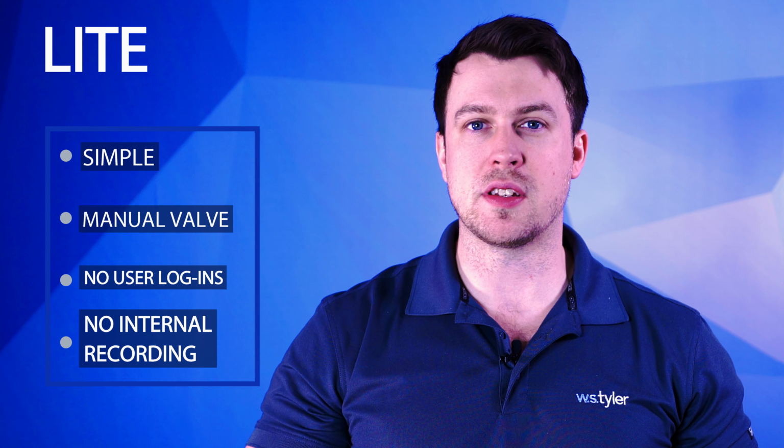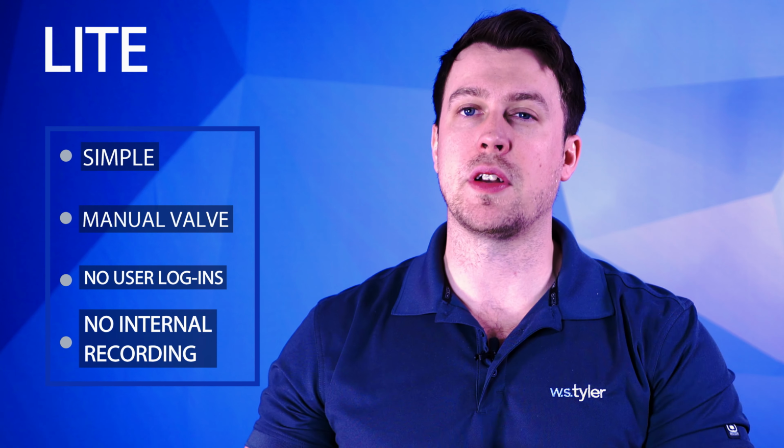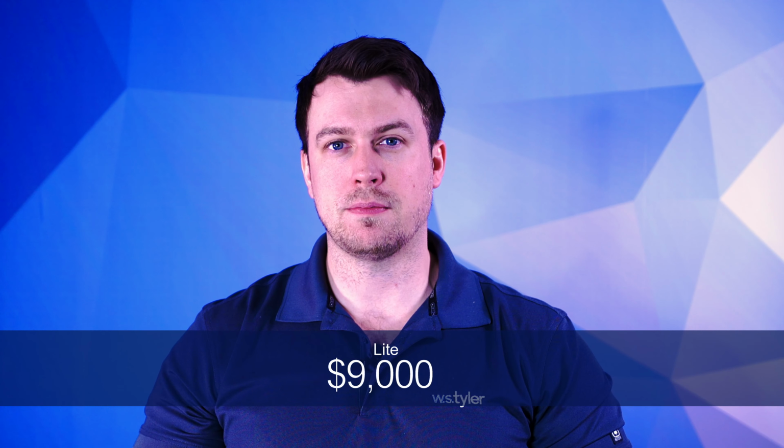All the data that you receive, you have to write down with pen and paper. And then from there, if you need to enter it into a system via Excel, whatever it may be, you have to do that manually. The Lite costs about $9,000.